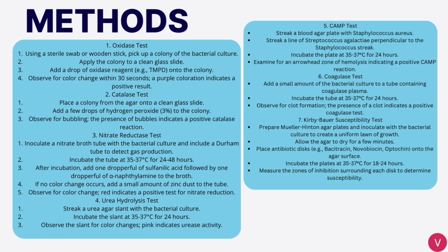For our coagulase test, we added a small amount of the bacterial culture to a tube containing coagulase plasma. We incubated it again at 35 to 37 degrees Celsius for 24 hours. And we observed for a clot formation, so the presence of a clot indicates a positive test.